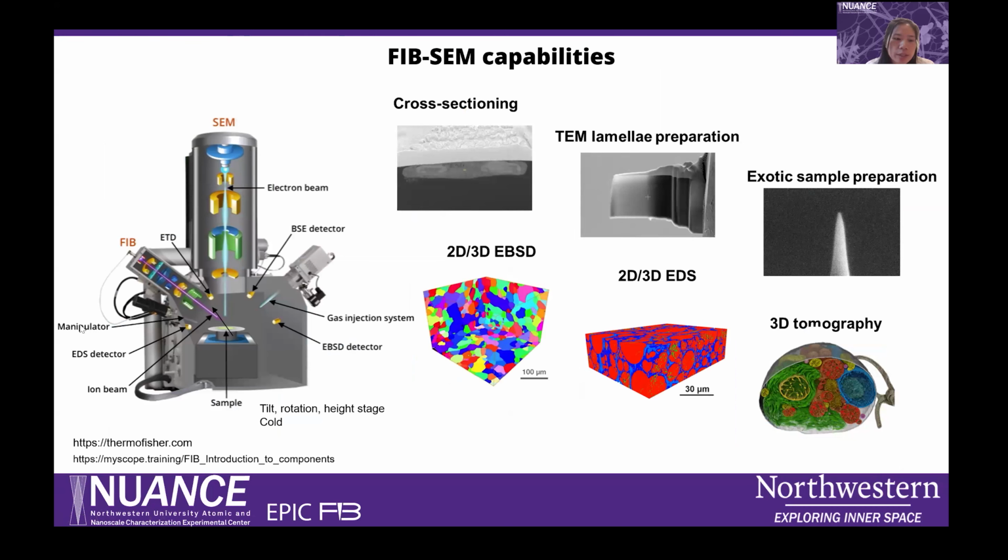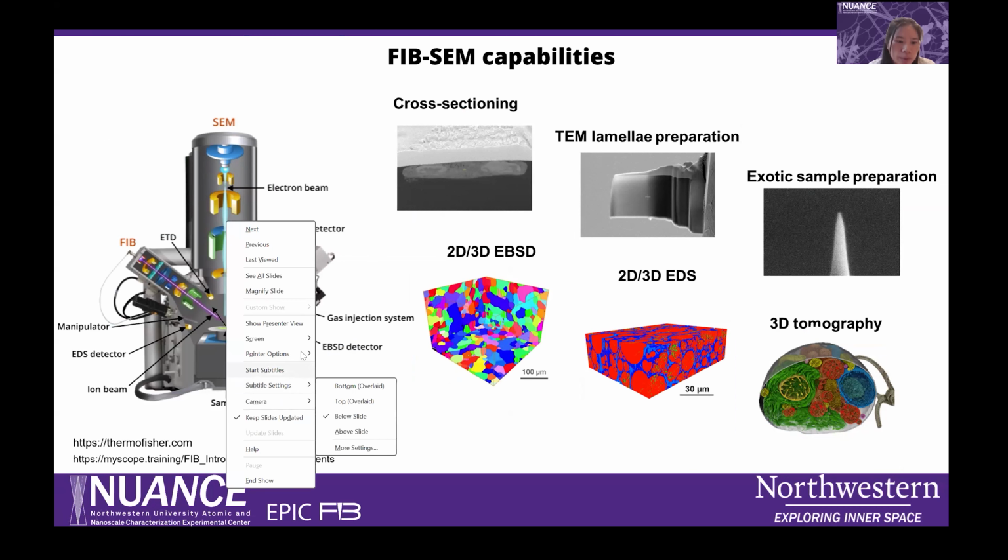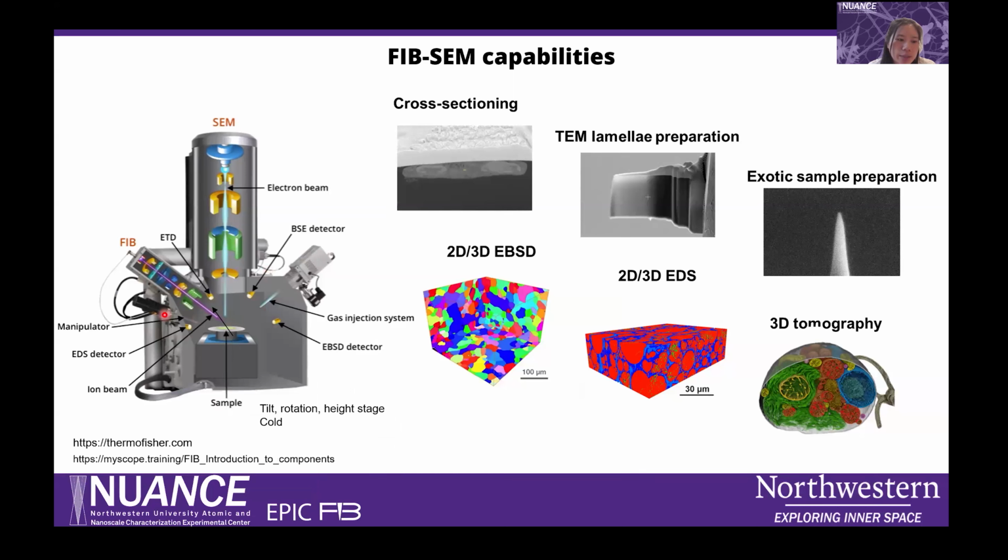So with these functionalities of the focused ion beam column, we combine them with the SEM column and other accessories like the manipulator, gas injection systems, and multiple imaging detectors, and also analytical detectors like EDS or EBSD detectors. And more important is the 5-axis stage, with tilt, rotation, height, and XY, at room temperature or low temperature. So we end up with a truly multifunctional FIB instrument.